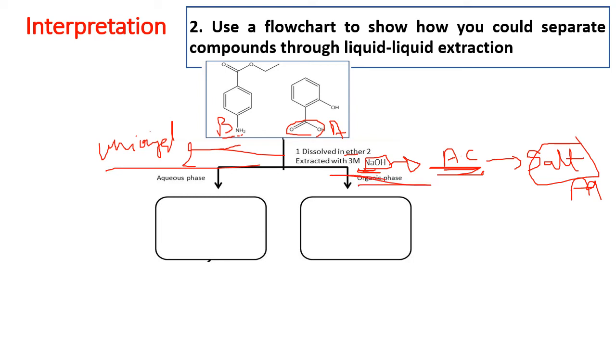However, in the aqueous layer, you are going to draw your acidic compound, but you cannot leave it as it is. You need to change this carboxyl group into the salt functional group. How do you do that? You just remove the H, so it turns to be O minus, having O minus Na, and this H will form a water with the OH of the sodium hydroxide.